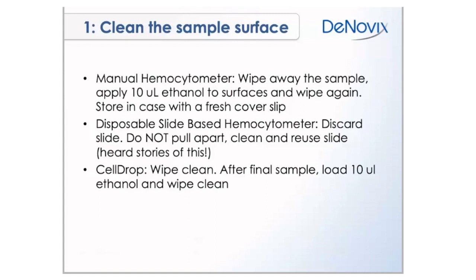We've heard and had people ask this question of what's the best way to pull the slide apart and then clean it and be able to reuse the plastic disposable slide. There's no good way to do that. Do not do it. It doesn't work. You won't have accurate data if you do that.